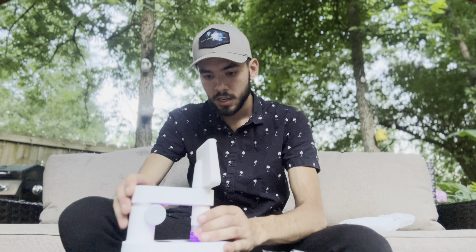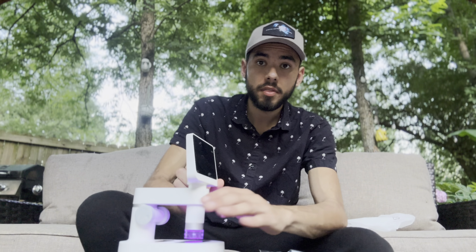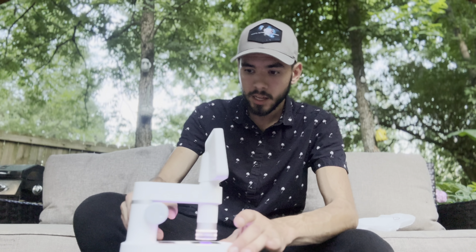You go ahead and put the little slider in, you can lift it up, push it down, and then just turn it on. One important thing to mention: if you ever buy this specific microscope, do not use a USB Type-C to USB Type-C charger — it has to be USB-A to USB Type-C, otherwise it will not charge correctly. I initially thought Type-C to Type-C would charge faster, but it ends up not charging at all. Make sure you use either the charger that came with it or another USB-A to USB Type-C cable.